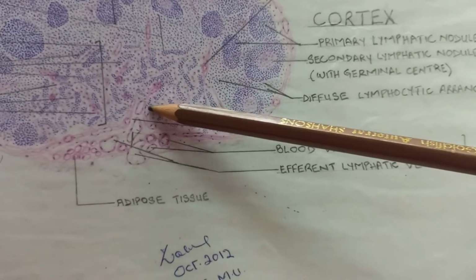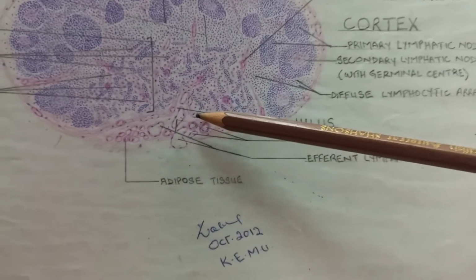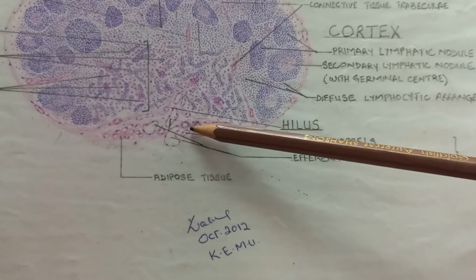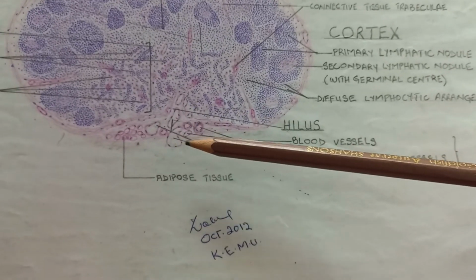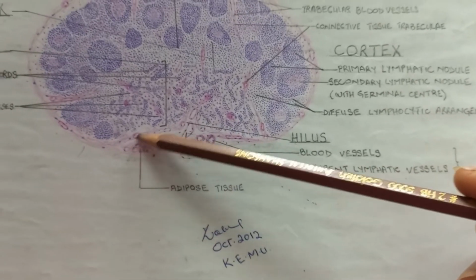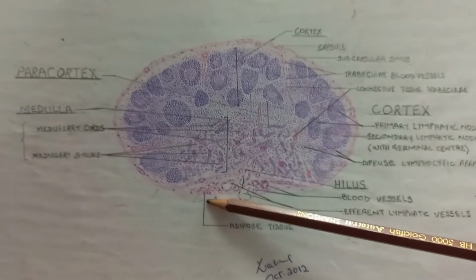This is the hilum. The hilum, as you know, is the site where the blood vessels and the lymphatics enter or leave. So you will draw the blood vessels and the efferent lymphatic vessels. And you will also draw some adipose tissue here.